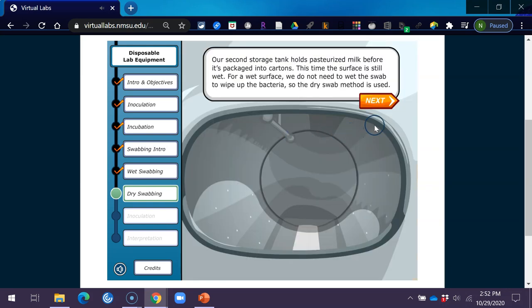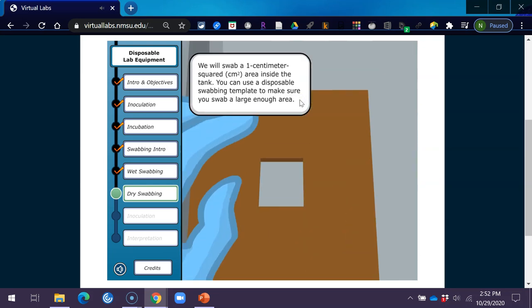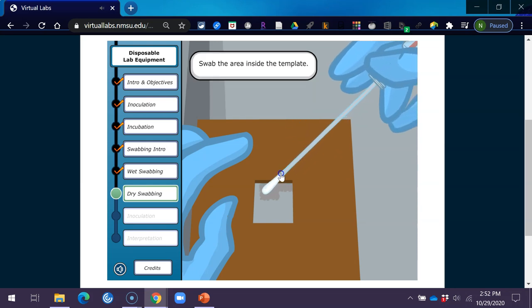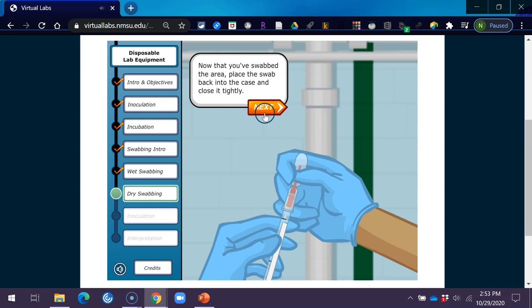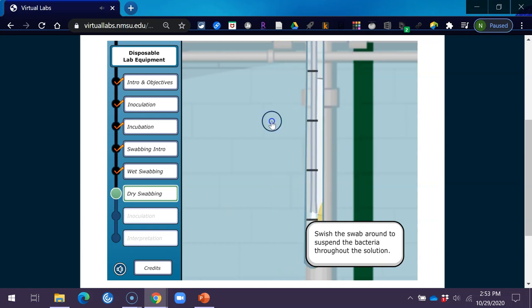Our second storage tank holds pasteurized milk before it's packaged into cartons. This time the surface is still wet, so we do not need to wet the swab — the dry swab method is used. For the dry swab method, don't break the reservoir. Simply remove the dry swab from the case and swab a 1 cm squared area inside the tank using a disposable swabbing template. After swabbing, place the swab back into the case and close it tightly. Now break the reservoir — the liquid will keep the bacteria alive until we get back to the lab. Swish the swab around to suspend the bacteria throughout the solution.